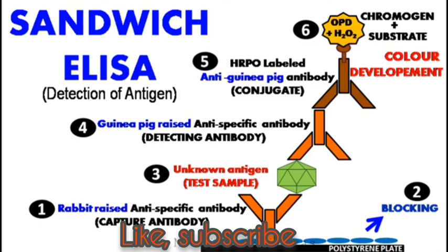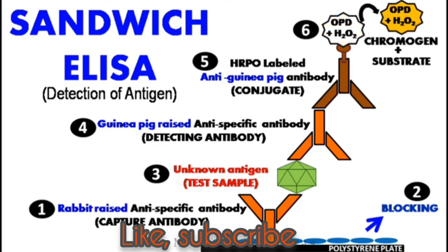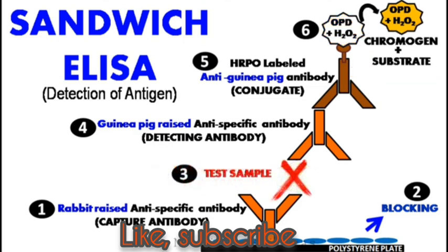The color development, which indicates the positivity of this cascade of reaction, happens only if the sample is positive for the particular antigen. In contrast, if the sample is negative for the particular antigen, the detecting primary antibody will not have opportunity to interact with the unknown antigen. In turn, the secondary antibody conjugate does not interact with the detecting primary antibody.